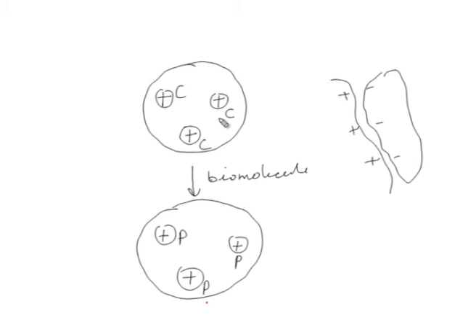Here you will put a high ionic strength eluent, which will replace the protein with ionic species from the mobile phase. As you increase the concentration of eluent, or ionic strength, say you add NaCl, depending on the affinities of the proteins, they will be replaced. If a protein has higher affinity, then you need a higher concentration of NaCl. So, the next step is elution.